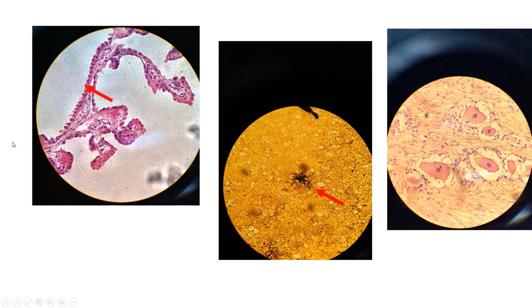All right, so moving on to some microscope slides. So these are ependymal cells. And this network of cells is called the choroid plexus. And do you remember they have cilia? The purpose of these ependymal cells is to produce cerebrospinal fluid. And this choroid plexus is located in the ventricles of the brain and central canal of the spinal cord.